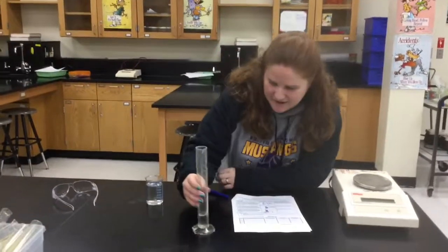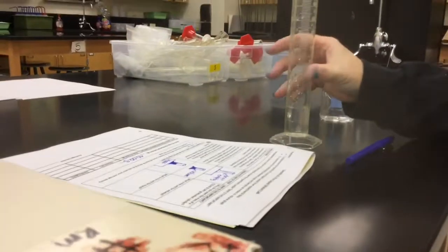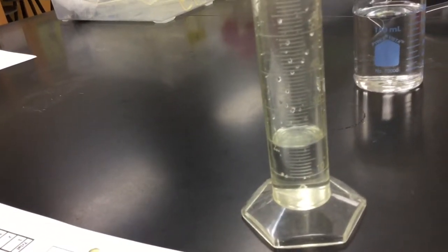All right, so where are you going to read the graduated cylinder? I'm reading it at the meniscus at eye level. Come here by you right now. Can you see? And to me, it looks like it is 19.0. Doesn't it? Agreed? Yeah, I agree. All right. Okay. So that's my volume.